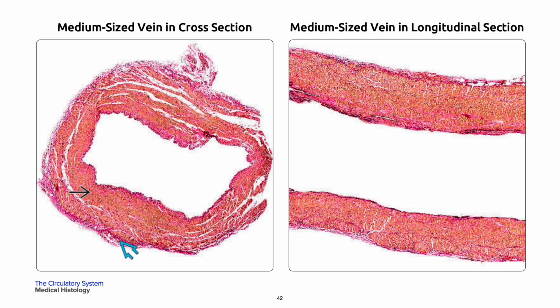Develop internal elastic layer beneath the intima. The small saphenous vein branch has a substantial muscular media in a single black arrow. There is also abundant adventitial elastic tissue in a bold blue arrow, but it does not form a discrete lamina. The adventitia is stratified with longitudinal and circumferential bands of smooth muscle and collagen.